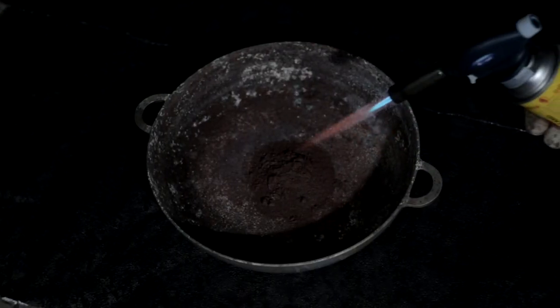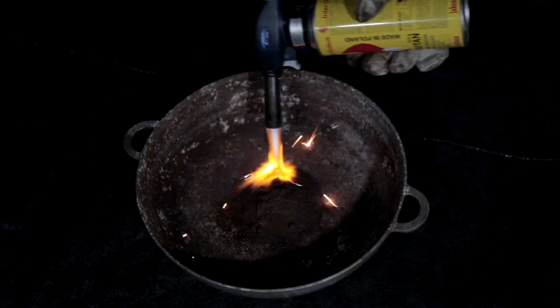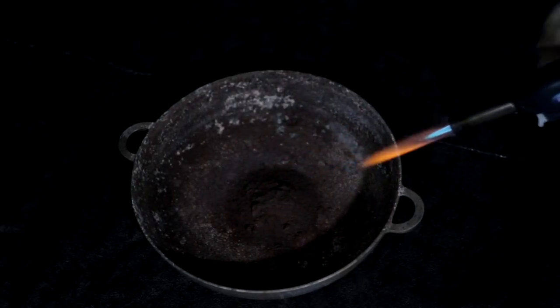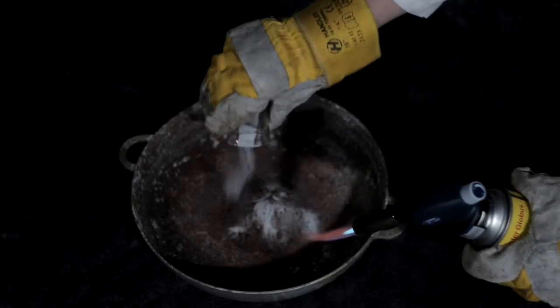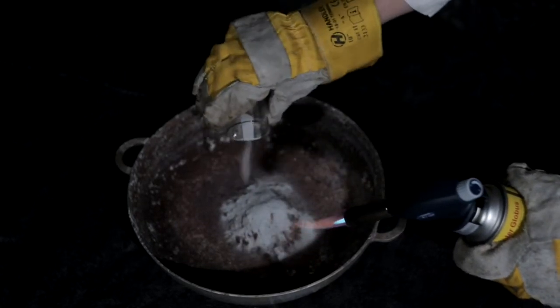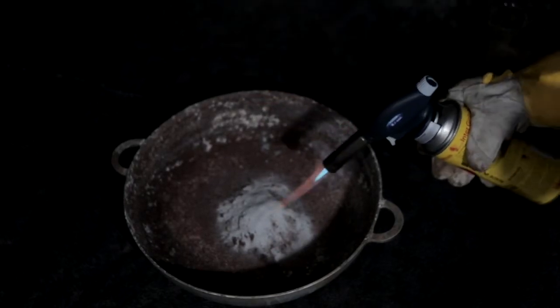Okay, let's see. So I will add more aluminum and that should help. Okay, so let's see one more time. Yeah, it's not going to work. Okay, let's add more aluminum and that should help out. We won't mix it because we need just for the aluminum to ignite, and then it will ignite the iron oxide too.